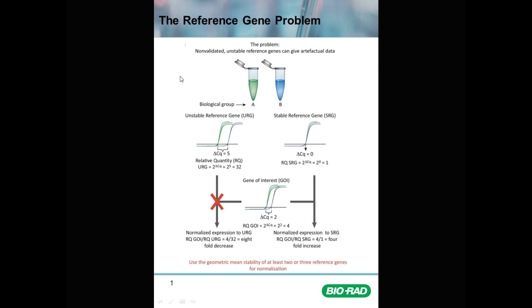Reference genes in labs are often chosen based on historical bias. Many labs typically always use the same one or two reference genes to normalize the data between all of their samples, for all of the genes and treatments they work with. The danger in doing this is that if the reference genes themselves have not been validated to assure that they are stable between samples, they can dramatically change the data.